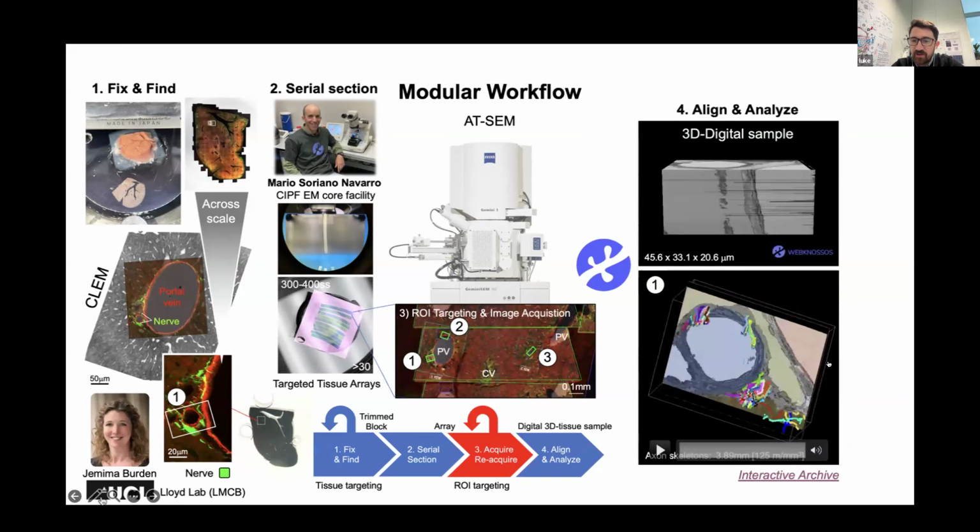And to give you an idea here, a comparison with the brain: well, maybe the liver is not the most intelligent organ. Within this sample, we have 4 millimeters of axons that have been skeletonized. That equates to about 125 meters of axon per cubic millimeter.